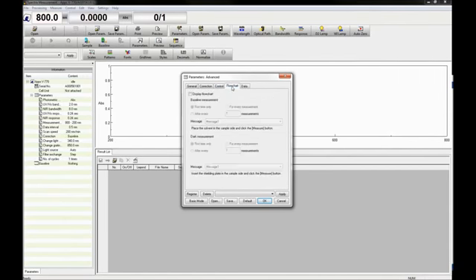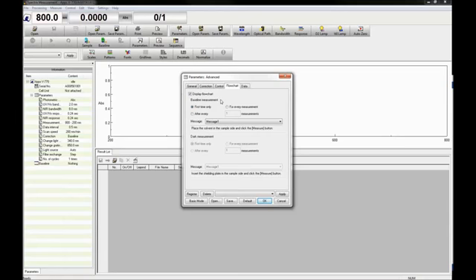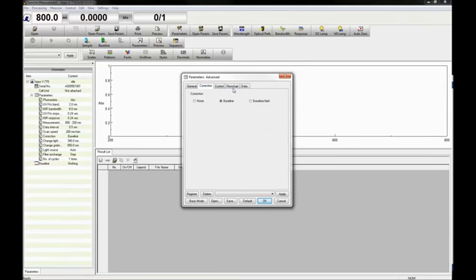The flowchart tab will display the measurement and data processing flow in the information bar to the left, dictated by said flowchart. If the flowchart option is selected, a sequence measurement cannot be performed and vice versa. You can select the timing of the baseline measurement if it has been selected in the correction tab.